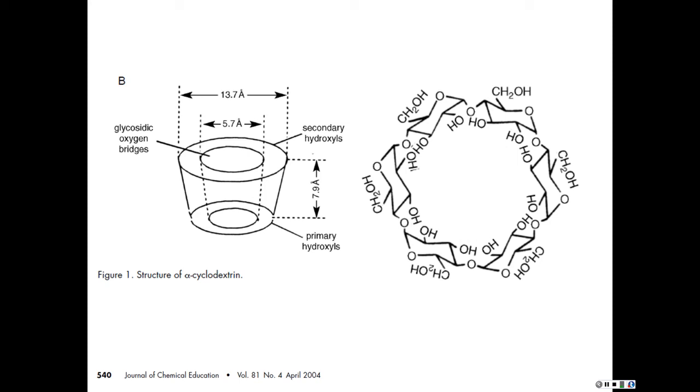Beta-cyclodextrin has a large enough cavity that both of the pseudoephedrines will stick in there nicely, so we're going to measure that. We're doing ITC. ITC stands for isothermal, which means constant temperature; titration, so we're adding things in specific amounts over the course of the reaction; and calorimetry, so we're measuring heat flow.